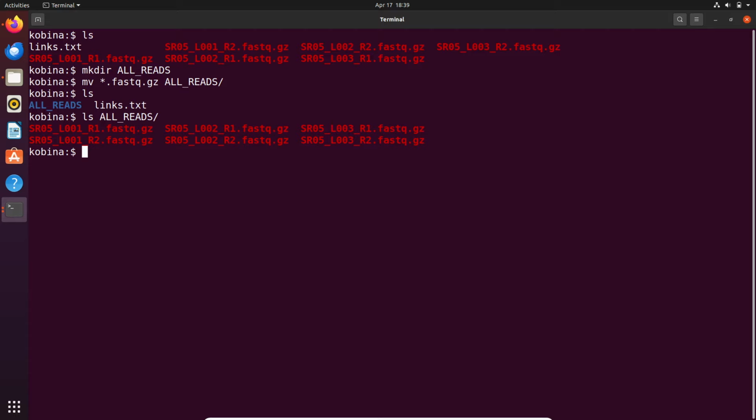All right, but if you take a look at what we have here, these are paired end reads. For each read, we have 3 lanes: lane 1, lane 2, lane 3. What we need to do is make sure that we're able to identify some information that will allow us to merge. This is where it becomes important to have a good naming convention. If you look at this data, all the read ones have this underscore R1. Underscore R1 is here, here, and here. We need that information.